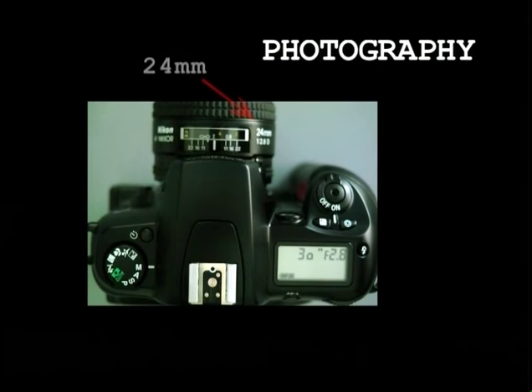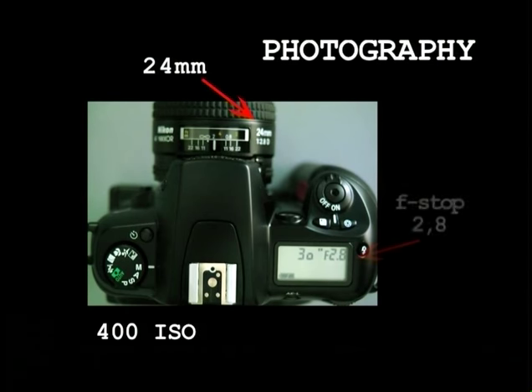Let me take this opportunity to remind you of the photographic parameters that can be used to reveal traces of latent blood. A digital or silver film camera and a film that is sensitive without being ultra-sensitive. It is unnecessary to use 800 or 1600 ISO. 400 ISO will be amply sufficient. You must simply ensure that the aperture is at the maximum, so it should be close to 2.8. The only thing is that these devices must have the option of allowing a 30-second exposure time, so a B exposure.